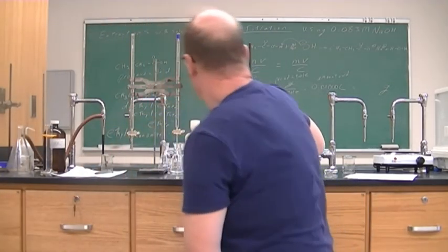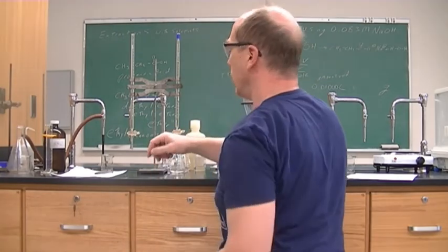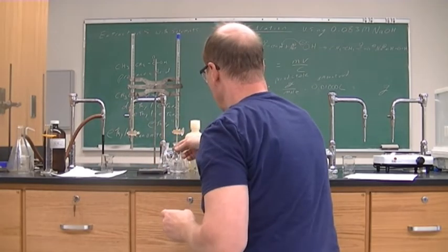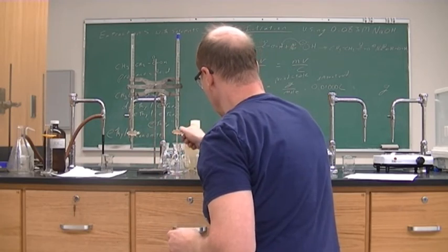Then we're going to add NaOH until we get an endpoint. This should be relatively quick because we should have extracted most of our acid.